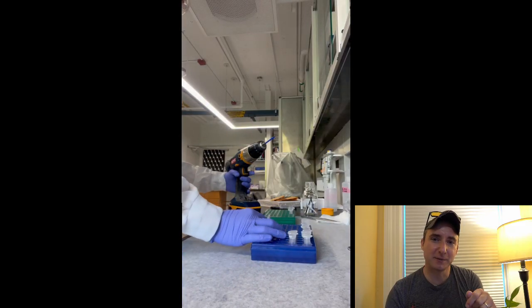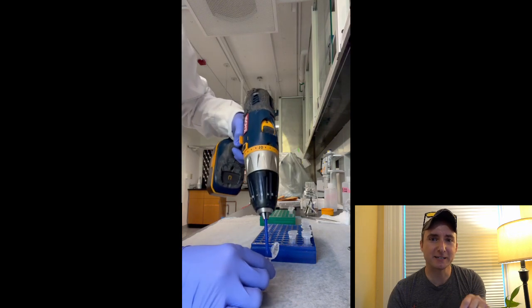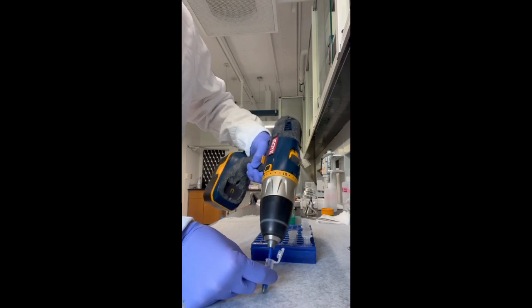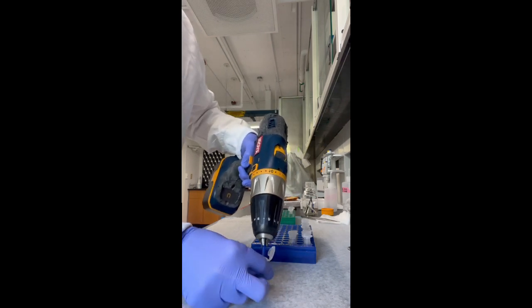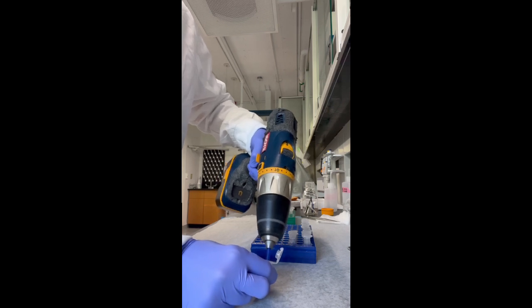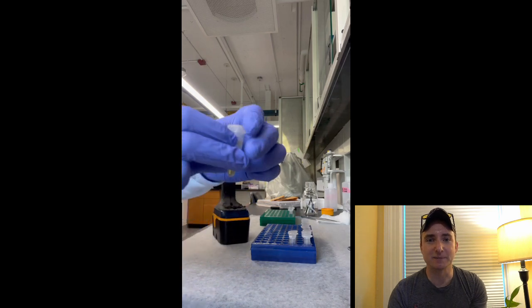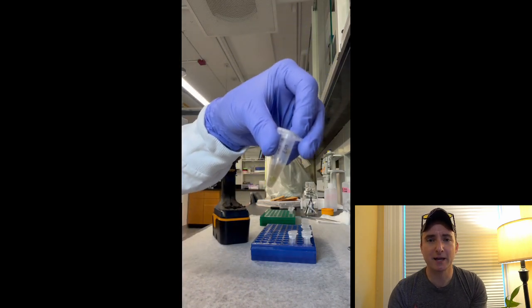Then you stick in the micropestle and you try to wedge the leaf sample up against the edge of the tube so that when you turn on the drill and spin it, you can generate a lot of friction, and that disrupts the tissue and tears it apart so that you get good lysis. And quickly you get a green solution. Usually the solution is green. Sometimes it can be red or brown depending on the pigments in the plant or the quality of the tissue, and that's all okay. At this point, you can freeze it.